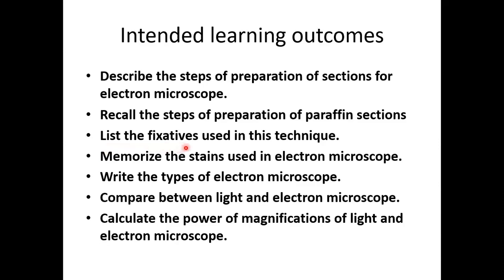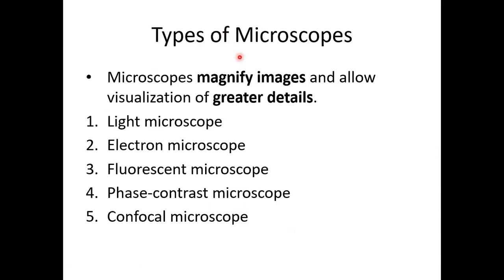List the fixatives used in this technique. Memorize the stains used in electron microscope, write the types of electron microscope, and compare between light and electron microscope. Calculate the magnifications of light and electron microscope. Let's start. Types of microscopes.